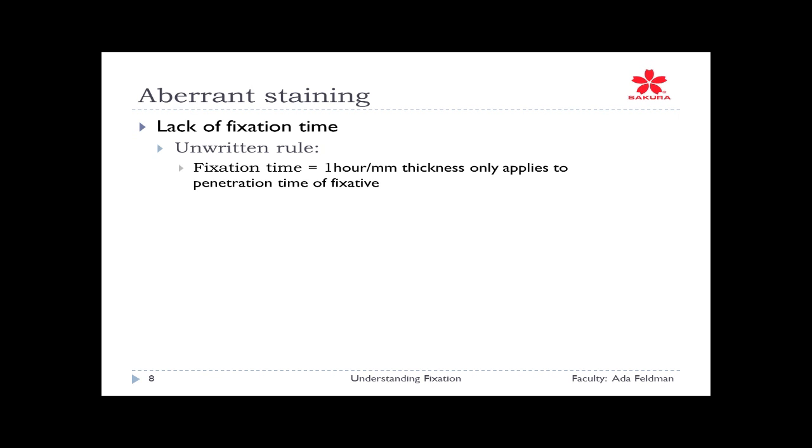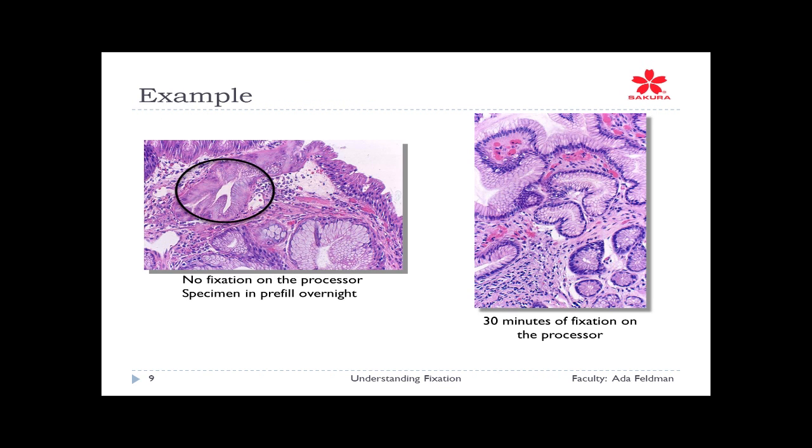All right, so let's start taking a look at a situation that I showed you about proper fixation. On slide 9 here is a situation that occurred, and the tech sent me the slide on the left, and the problem was what's inside that circle that the pathologist was constantly complaining about, this washed out. You could see no good nuclear detail of what was going on. Now the tech thought that there was adequate fixation time because the specimen was taken in doctor's offices. It stayed in the small specimen container overnight.